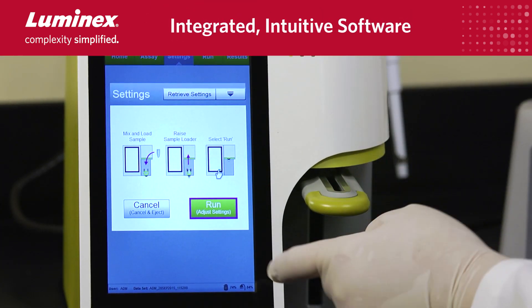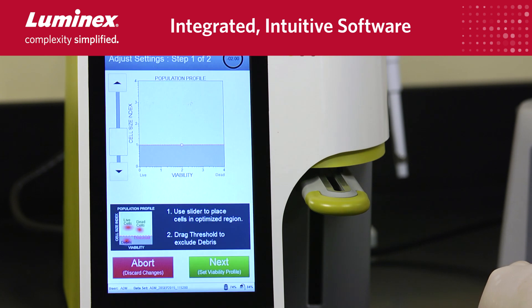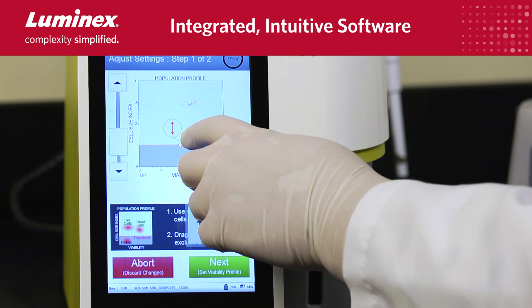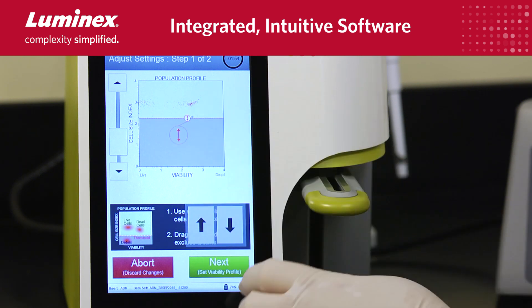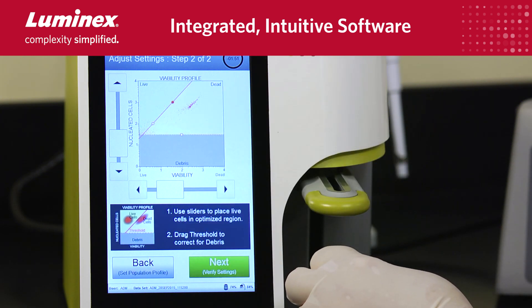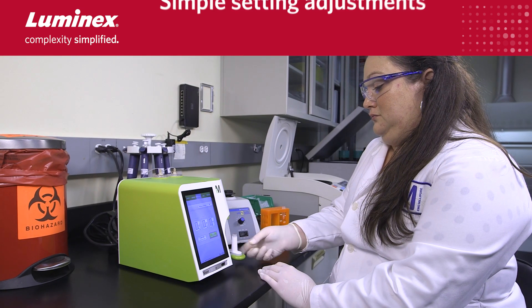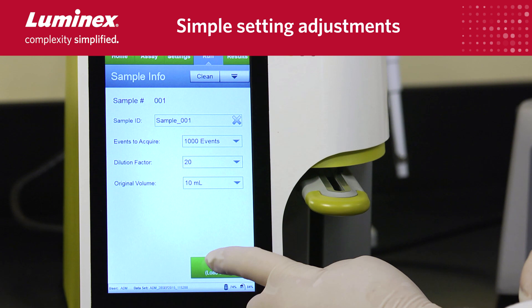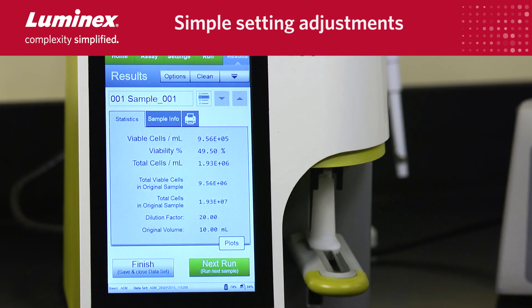The Muse instrument features a large, high-definition touchscreen interface instead of an external PC. The unique software provides simple, step-by-step prompts so virtually no flow cytometry expertise is required to run assays. The system prompts with clear instructions for sample loading, simple setting adjustments, and results in just a few steps.